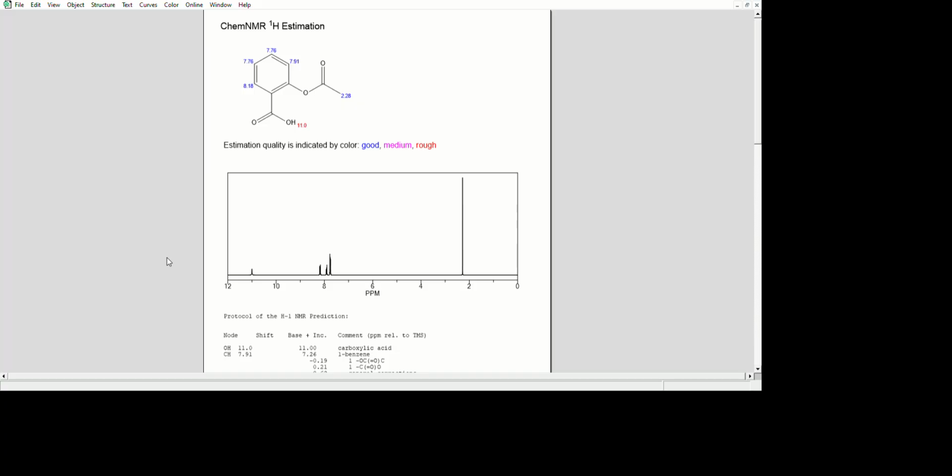You can see in the compound there are aromatic protons, aliphatic protons and a free proton. I can mark them here also. This is an aromatic proton. Aromatic means the proton that is attached to an aromatic ring. Aryl, arene, you know it. That is the benzene type structure that is joined with the proton. They are known as aromatic protons. After that, we have the aliphatic proton. This is the aliphatic proton.